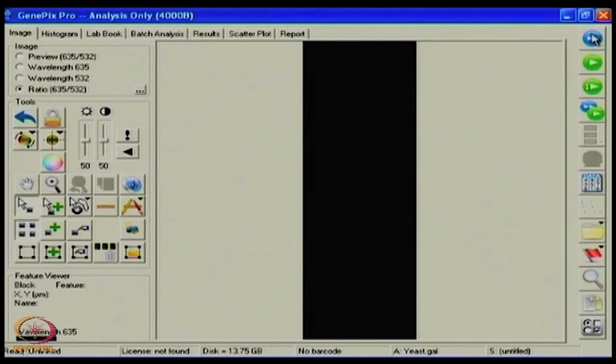The first one is a preview scan, and then you can also have a data scan. One stands for one wavelength, so it allows you to take an image from only one wavelength. And then you also have multiple scans, so you do a preview scan, then you do a scan with this button. You also have other buttons which will light up as and when you acquire the image, and this is for the analysis. Once you click this button, the analysis will be performed after the alignment.